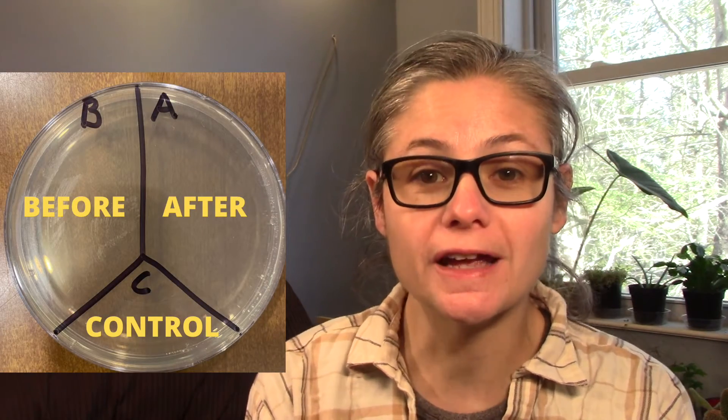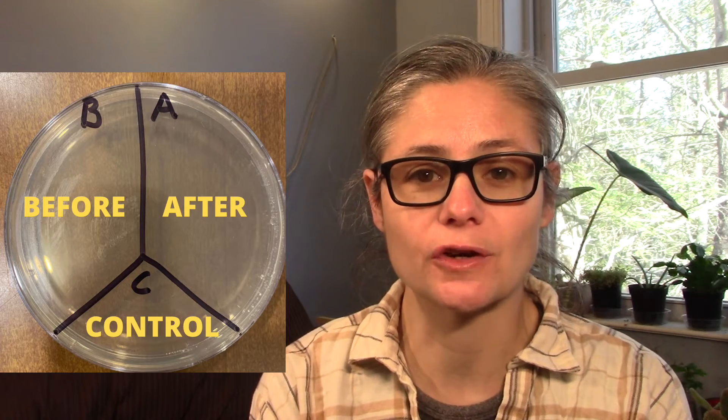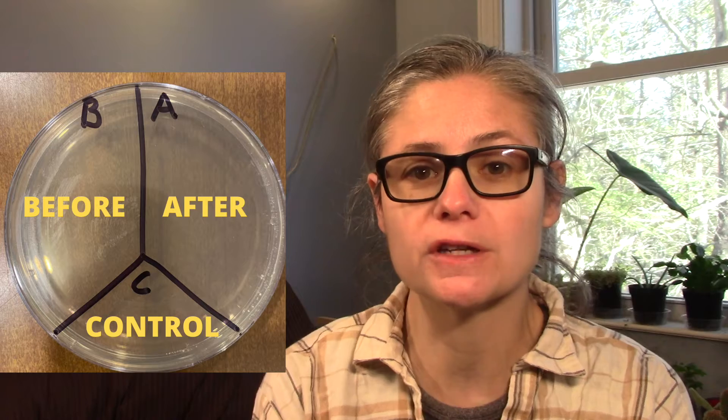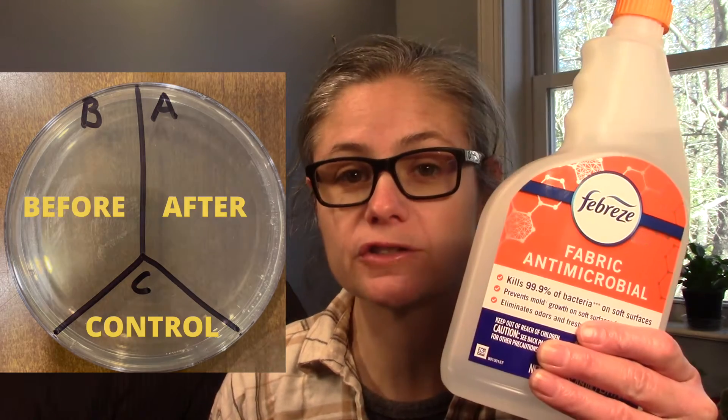In order to test how well this spray works, I'm going to take a petri dish and label it A, B, and C. Then I'll take some sterile swabs and swab areas on my couch — two samples from the arm and two samples from the seat. I'll place those samples on B for before. Then I'll sanitize according to Febreze's directions: spray from a distance of six to eight inches evenly until damp to kill bacteria, and the fabric must remain wet for five minutes.